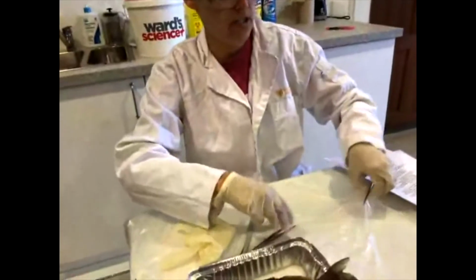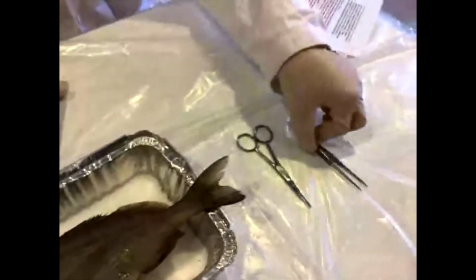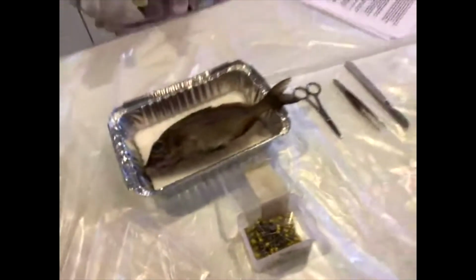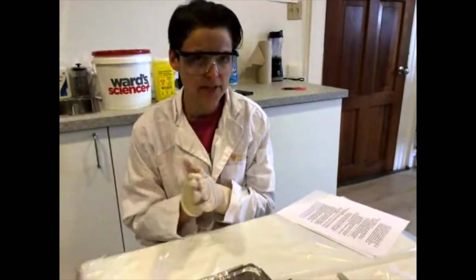And then some of the tools that I'm using today, I've got some dissection scissors, I've got some forceps, but we also know those as tweezers. And then I've got a little scalpel here and a dissection pan and some pins. So we should be ready to go. Does anyone have any questions before we dive in here? I think we're maybe good.